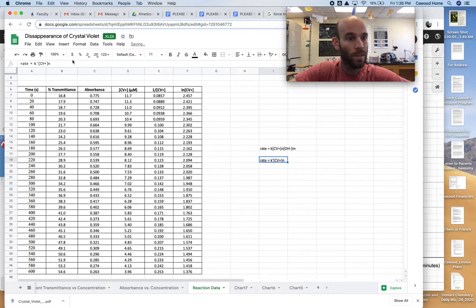So we can still establish the n, let's see here, should hopefully let me go superscript. No matter. The order of crystal violet is first order, because the natural logarithm of crystal violet versus time, as we hold hydroxide concentration constant, it's really, really high, so it's constant, we're still able to establish that the reactant here, CV plus, is first order.